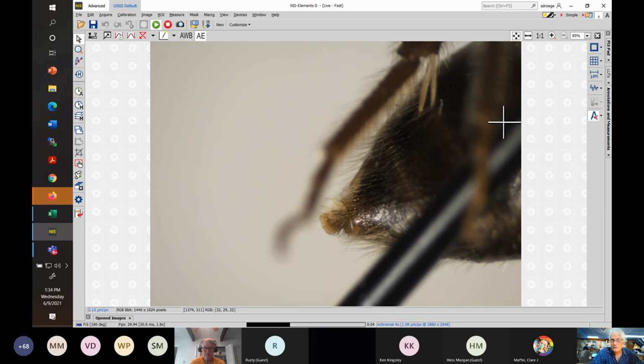Remember that in the spring, at least in the East, Andrena is a huge presence in almost all kinds of netting surveys and traps and other things. So you will get a lot of Andrena no matter what. And so over time, you'll just begin to recognize it from its size and shape. But here's S8 again, and it's good to point this out because, again, it's a hard thing for some people to find or feel confident about when they're looking at specimens. Note also there's no genitalia exposed here. It's retracted inside the abdomen and not visible.